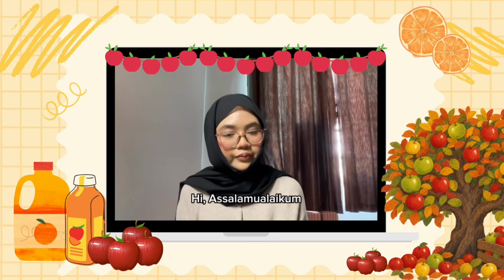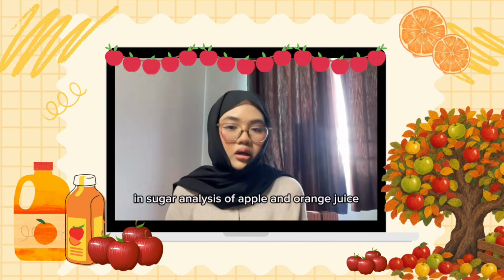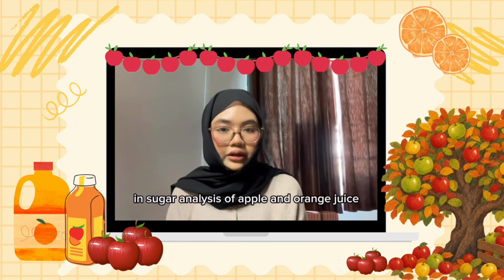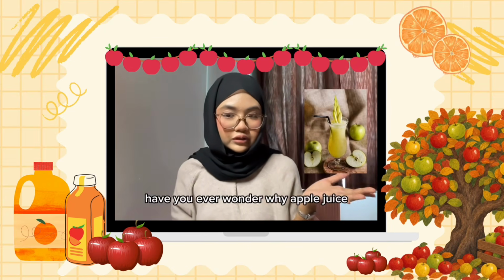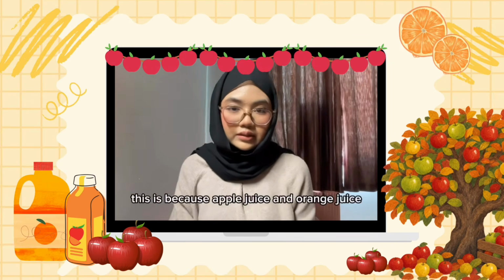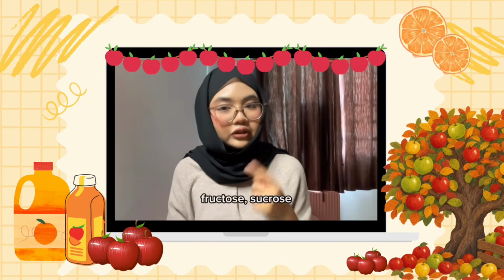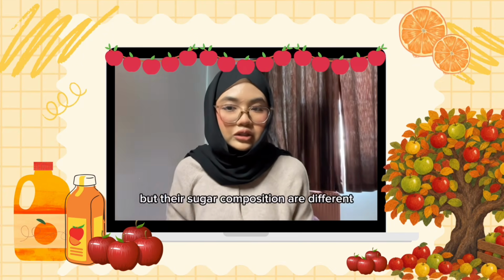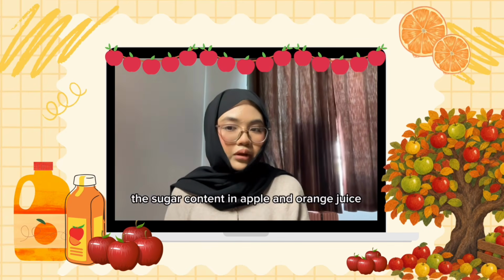Hi, Assalamualaikum, and I will be explaining the application of chromatography in sugar analysis of apple and orange juice. Have you ever wondered why apple juice and orange juice have different levels of sweetness? This is because apple juice and orange juice contain sugars such as glucose, fructose, and sucrose, but their sugar compositions are different. So, chromatography is applied to analyze the sugar content in apple and orange juice.